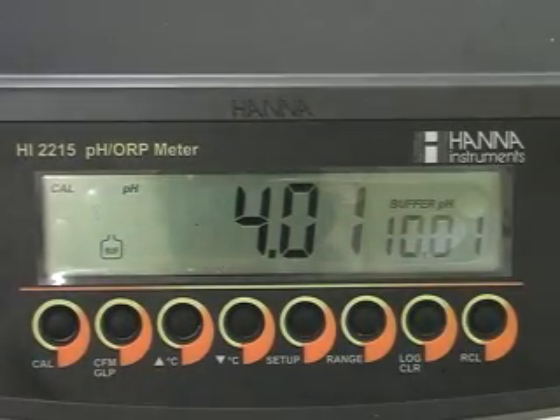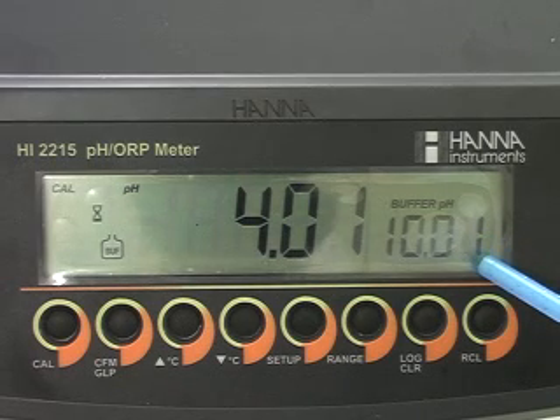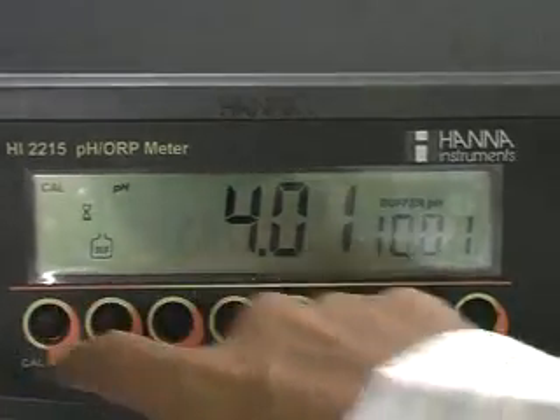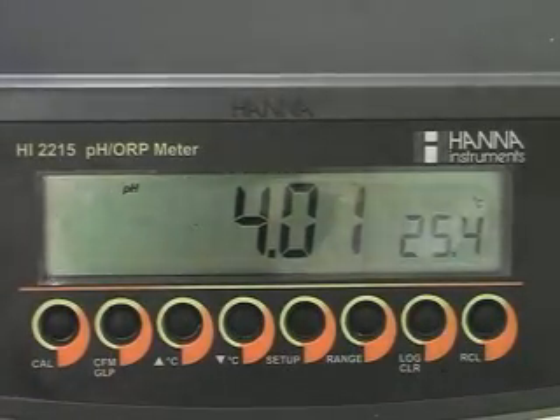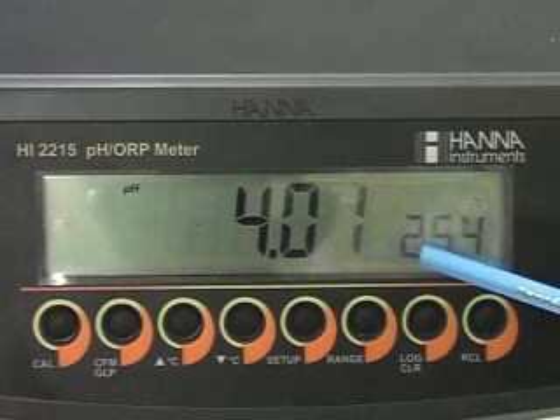After this 2-point calibration, the instrument will show you the 3rd point, that is 10.01. At this time, please press CAL to exit the calibration mode. The instrument will memorize the calibration data and it will return to measurement mode.